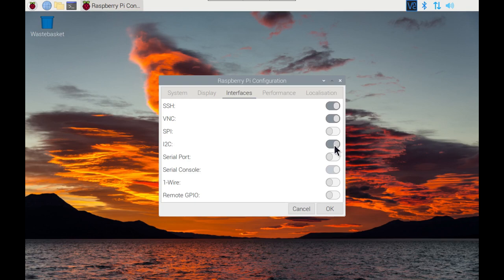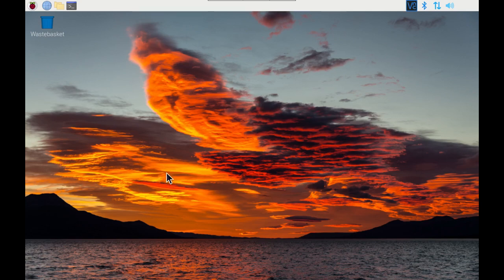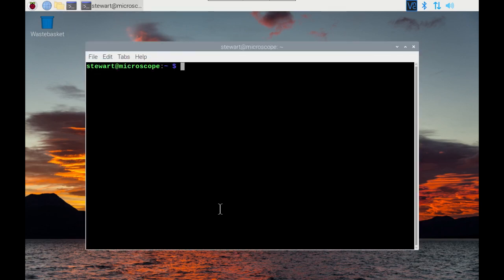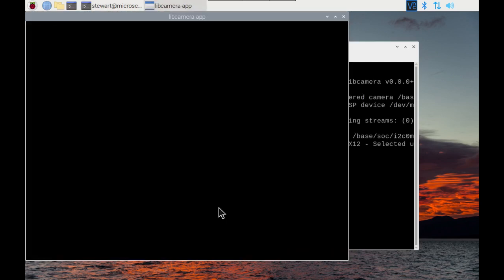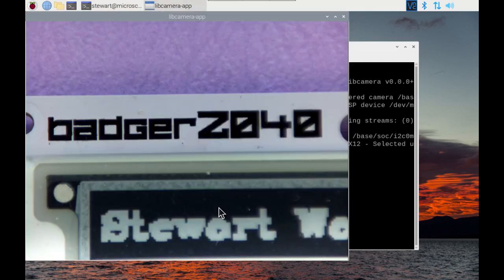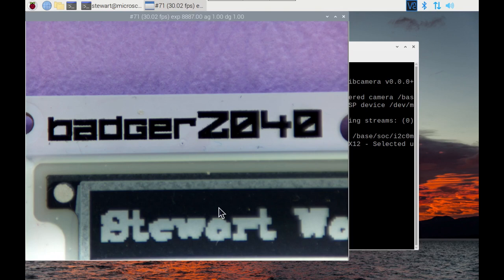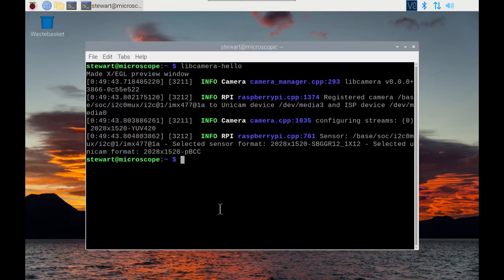And you can now just run a preview by running lib camera-hello from the terminal. As you can see there's a short preview displayed, so we know that the camera is connected and it's been recognized correctly.